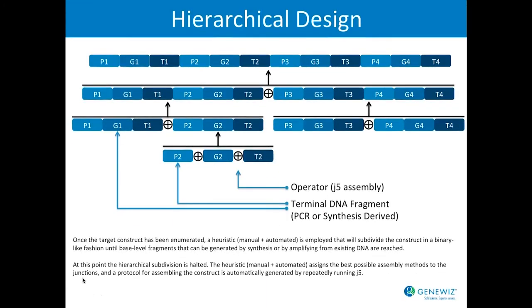So let me go into a little bit about our approach with Dow. Like I mentioned, they're making very big gene stacks. If you think of a piece of DNA as just a string, you might think, okay, all I need to do is partition it in half, and then in half again, and again, until I get to some little oligos I can synthesize, and then I'll use various techniques to reassemble that back into the construct. And yes, that does work. But what we found is the world is quite heterogeneous, and people are doing all kinds of crazy stuff. Sometimes they think in functional units, sometimes they think in just raw blocks of DNA. So we're taking the approach that we want to accommodate any user's strategy for doing DNA assembly.